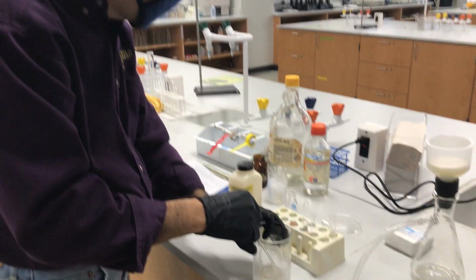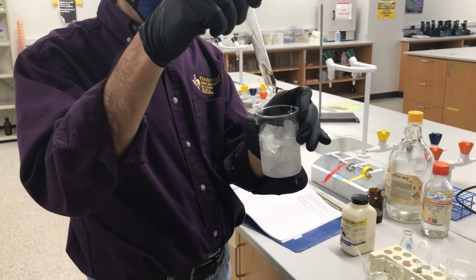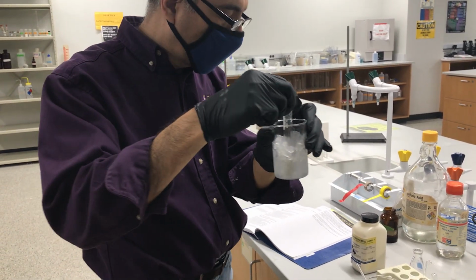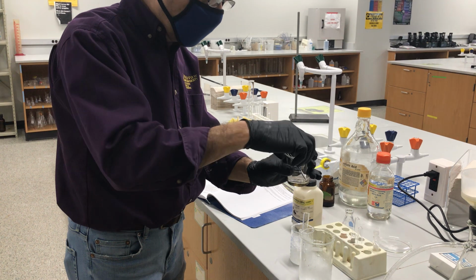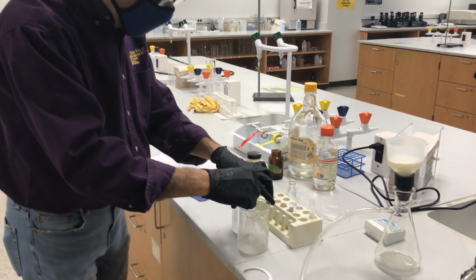Why? Because I need to add my nitrating solution. This is my nitrating solution, which is a mixture of sulfuric acid and nitric acid. This is what I want to add to this compound. So this is what I'm going to do. Let's make sure it is cold enough.